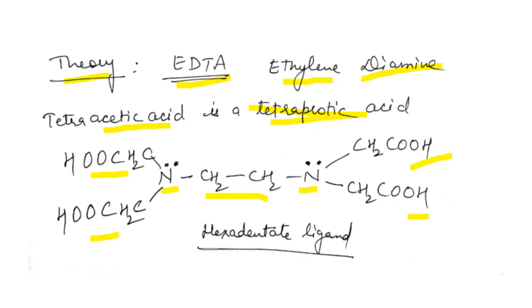So having these two protons and these two protons, it is a tetraprotic acid.